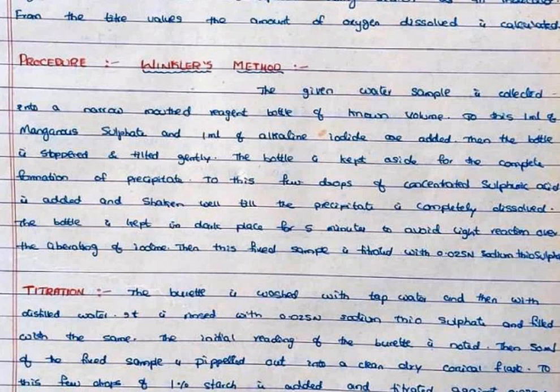The bottle is kept aside for the complete formation of precipitate.